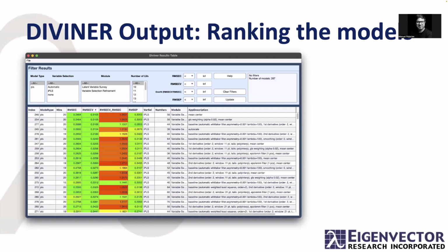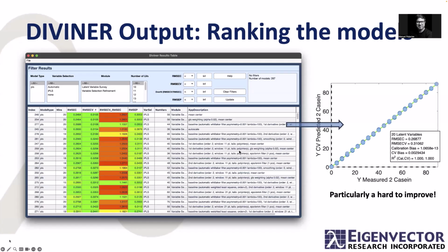All right. So this is one of the outputs that we get from Diviner. One of the things that I really like is that you can export anything from here to the analysis window, and you can have multiple selections and save all these models that you have in your top rank together. One thing I want to point out is that these models are already performing really well.